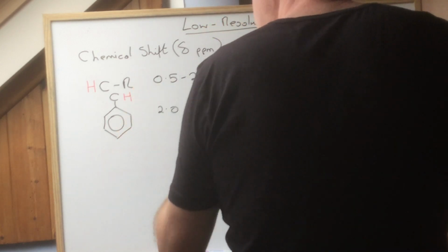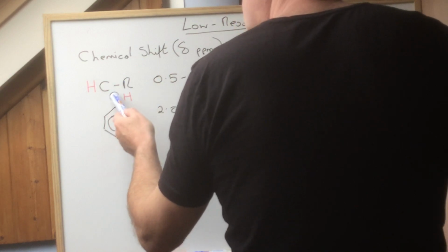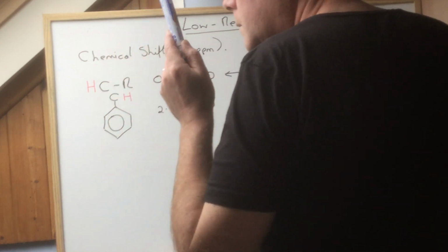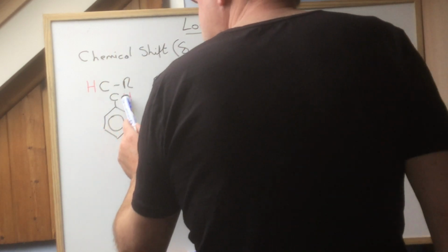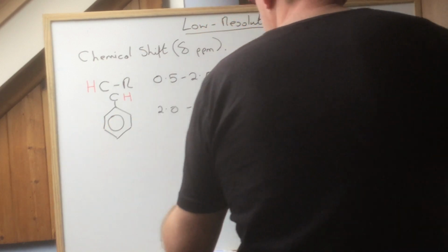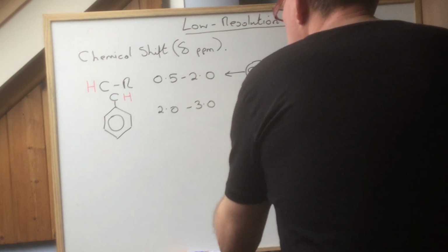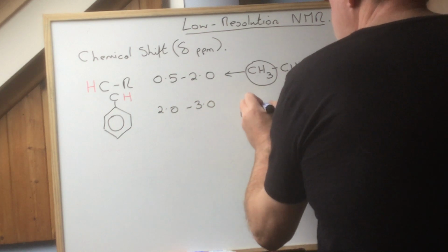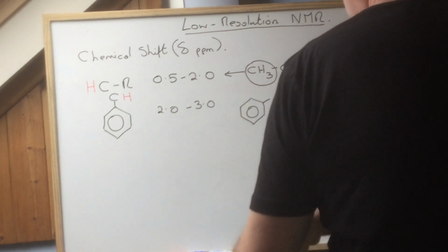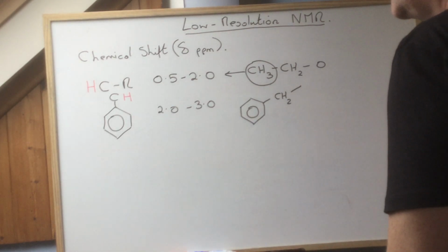That is the chemical shift for protons attached to a carbon which is attached to a carbon in a benzene ring. Classic sort of thing might be this. You've got a benzene ring, which we'll discuss later. I'm tilting this a bit. CH2 on there, then it goes on. Those two protons will have a chemical shift in that environment. It's as simple as that.